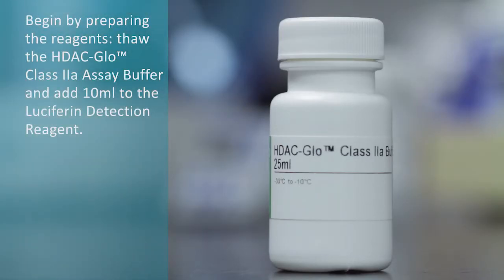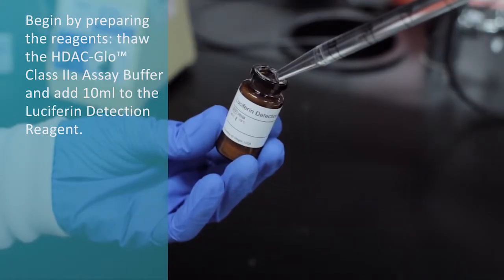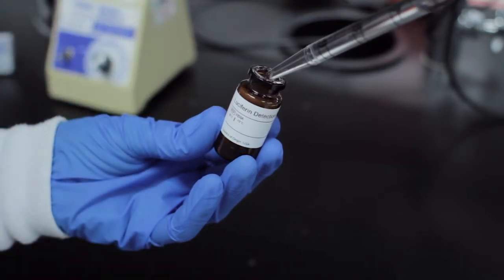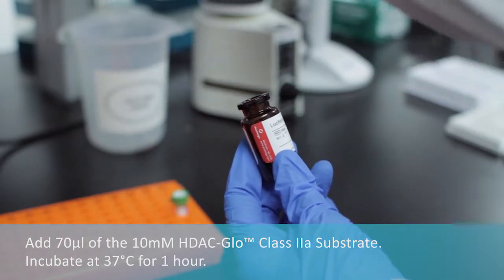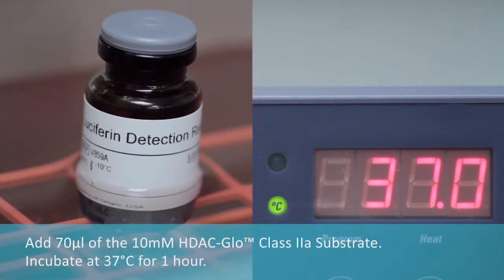Begin by preparing the reagents. Thaw the HDAC-Glo Class IIa assay buffer and add it to the luciferin detection reagent. Add the HDAC-Glo Class IIa substrate. Incubate at 37 degrees Celsius for one hour.